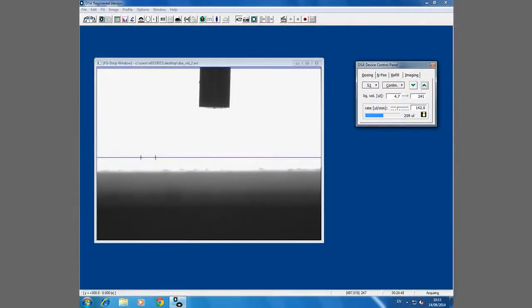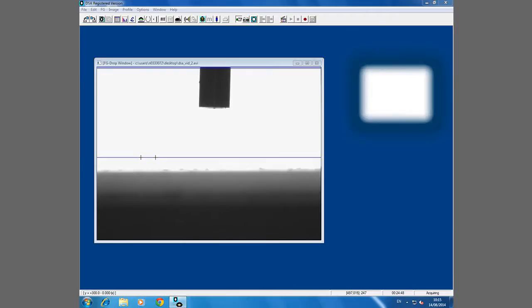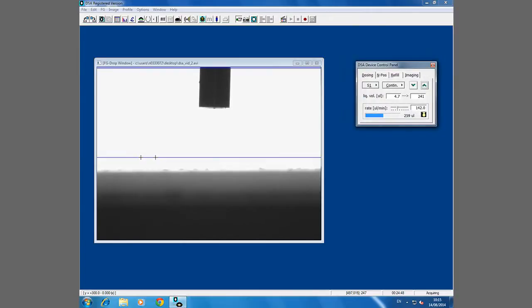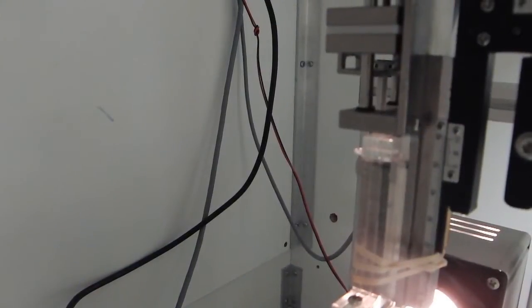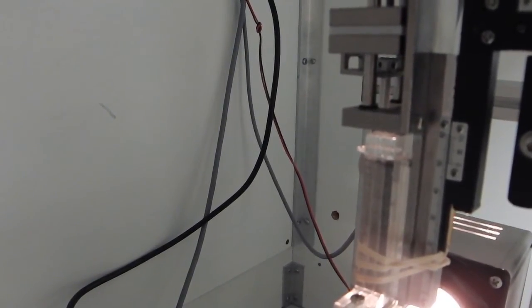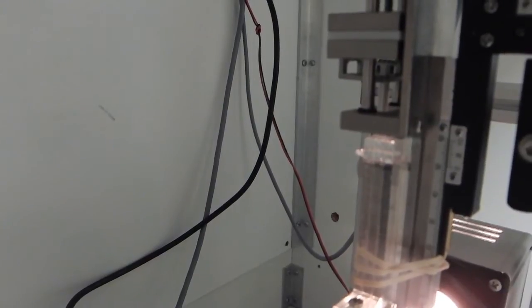We can check it's in the right position by observing the video output window. Also here we can see the syringe control panel. Using the syringe control panel, we slowly depress the syringe until a small drop of liquid is forced out of the end. This can be viewed on the video window.